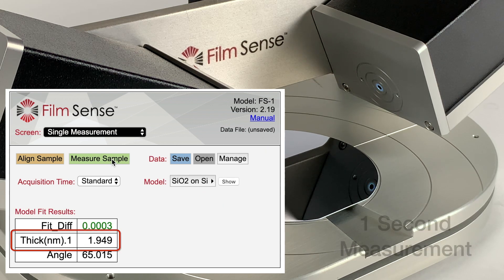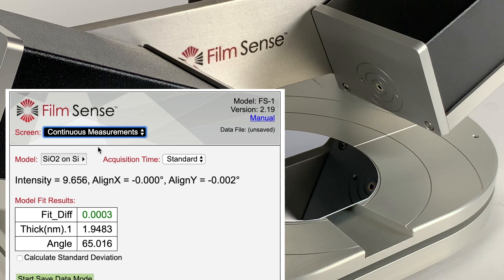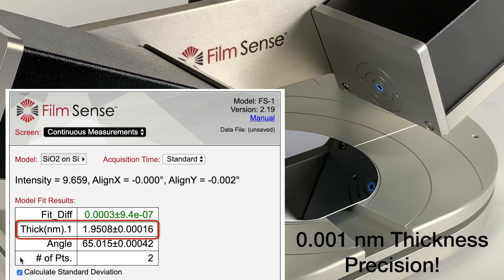A typical measurement only takes one second. The continuous measurements mode can be used to demonstrate the excellent thickness precision of FilmSense ellipsometers. For many samples, a 0.001 nanometer standard deviation in thickness can be obtained by a one second measurement.